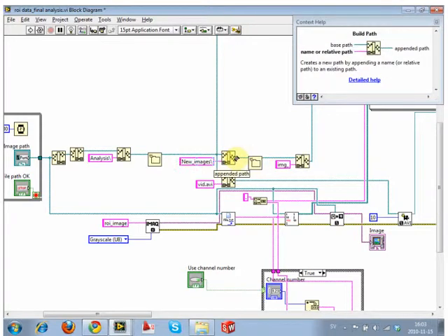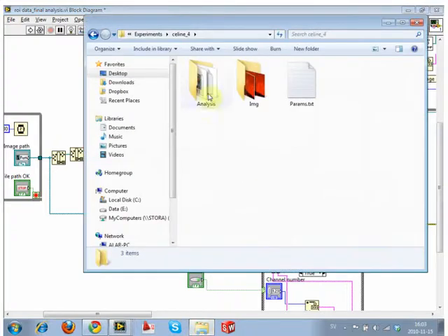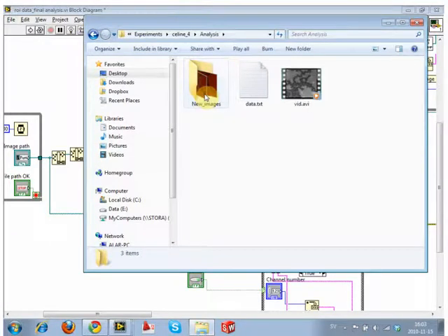And I don't need to show you guys where these come from, because I think you guys have a grasp of why you need to do this structure. It just makes your life a lot easier. If you don't put things where your actual data is, you're much better off. Actually, Leica does a real good job of sticking everything in the same folder: LEI files, data, text files, region of analysis data. I mean, why would you put it all with the images? Why wouldn't you do it like this, where you have a data folder? That way you're not disrupting your original image files. They're all there, you never touch them.